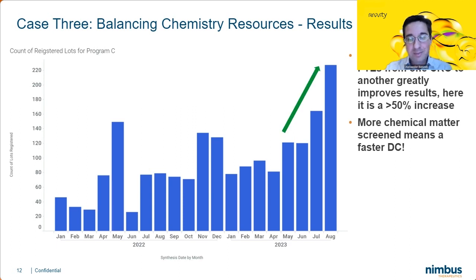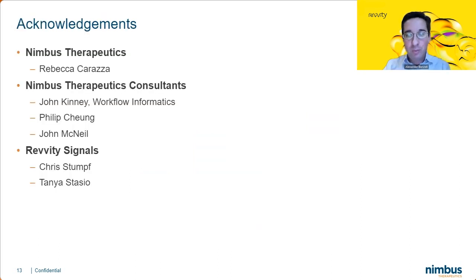Ultimately, no matter what you're looking at, or in these cases whether you're looking at biology or data or chemistry, we were able to get these visualizations and improve our research efficiency because of how we could bring everything together in one place in Spotfire. And it wasn't easy. There's a lot of moving parts to being able to just open up this Spotfire template and look at anything you want and slice it and dice it the way that you need. So there's a few people we really do need to say thank you to.